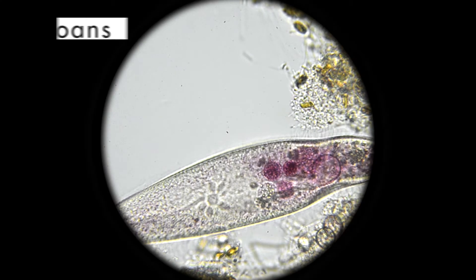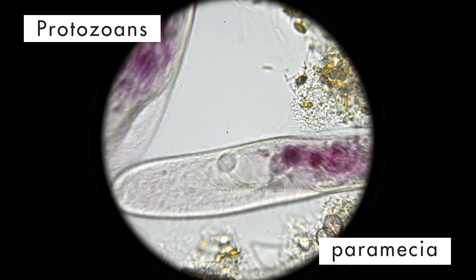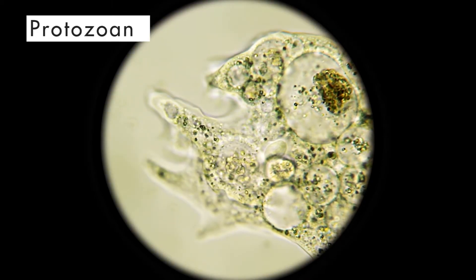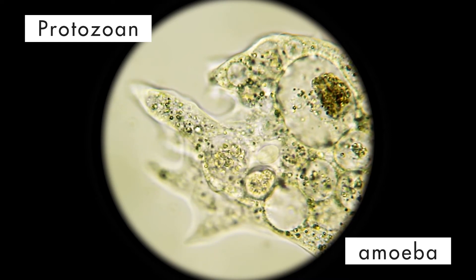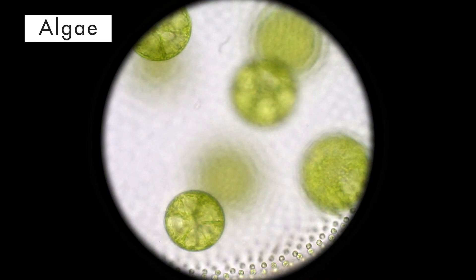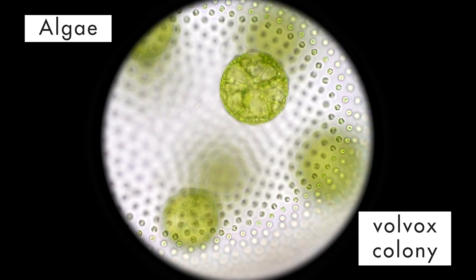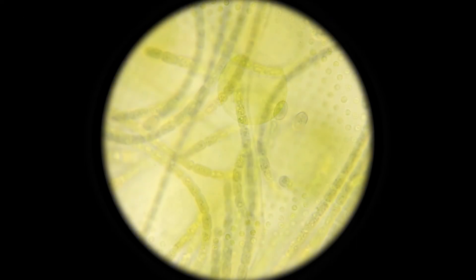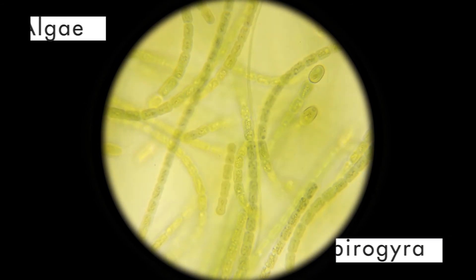The water is teeming with protozoans. Here are a pair of paramecia. Here is another protozoan — it is an amoeba forming a false foot, or pseudopod. In addition to protozoans, we see algae. Notice the volvox colony with several daughter colonies inside the parent colony. Here are some filamentous algae called spirogyra. Who would have thought that just a drop of water would be teeming with so much life?